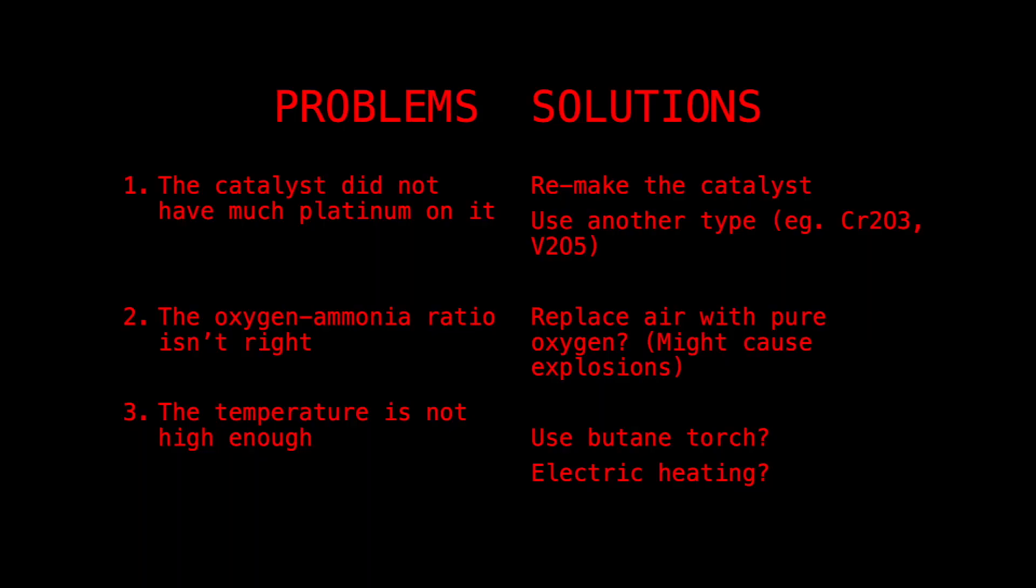The first problem is that the catalyst did not have a lot of platinum on it. In the video on the catalyst, I did not dissolve a lot of platinum into the solution, because I did not have a very concentrated hydrochloric solution, and the peroxide wasn't concentrated as well. So I'm considering to remake the catalyst using a more concentrated hydrochloric acid, or to do it in a different way, like change the catalyst. For example, I heard that using chromium 3 oxide or vanadium 5 oxide might work.